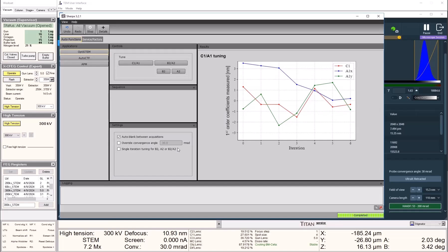Now we have just opened Sherpa software. In the OptiStamp control, you see a button for C1, A1, and it's equivalent to what we just did earlier in VLOG. It also has a B2, A2 button. Let's click the B2, A2 button.